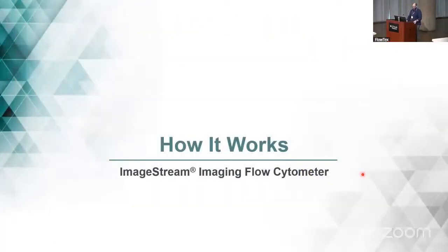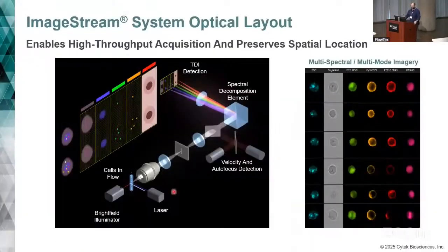So how it works. The foundation is that it is a CCD detector, and there are multiple channels within that CCD detector, so it's essentially spread out.